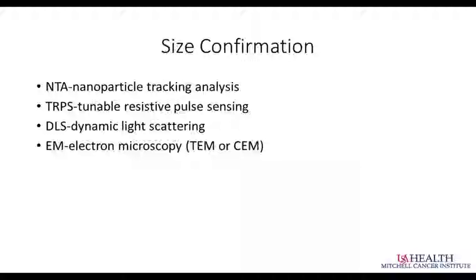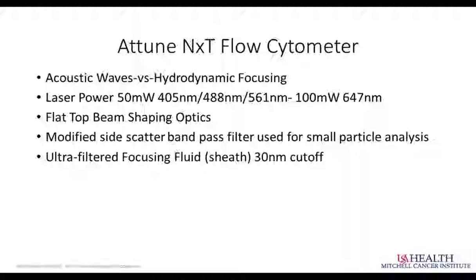And really, many people want you to at least show that to make sure that you're correlating and that the other instruments that you've used actually are accurate. So we do, from time to time, submit samples for EM just to double check and make sure we're on track with everything. Quickly, I'll mention, I think I will say it later, but here at our center, we use DLS for sizing our exosomes.